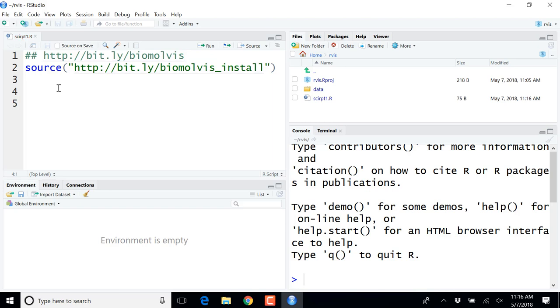Right. So let's start with the data that we have. I'll introduce the raw data when we get there tomorrow at some point. So the first data set that we have is the iPRG data set.